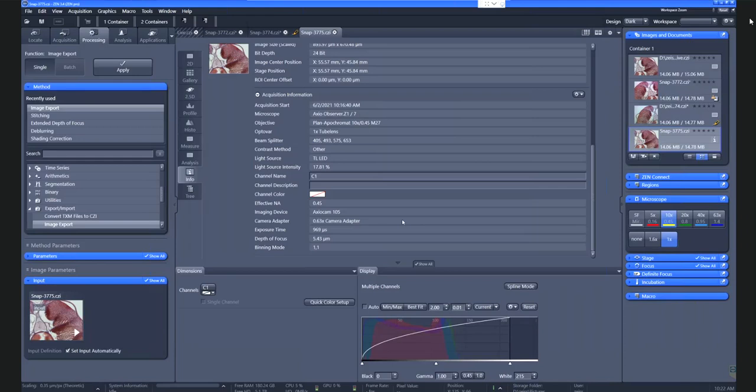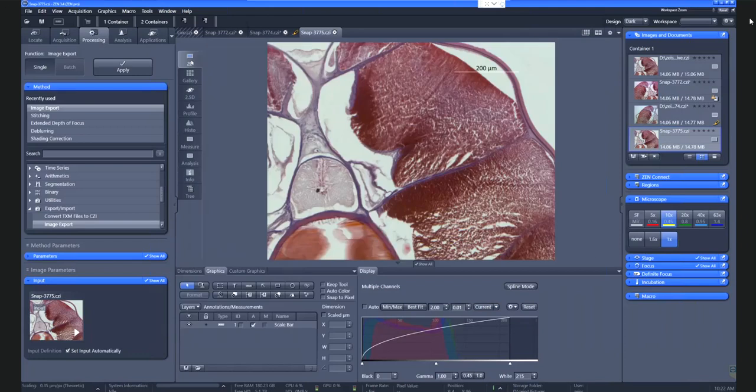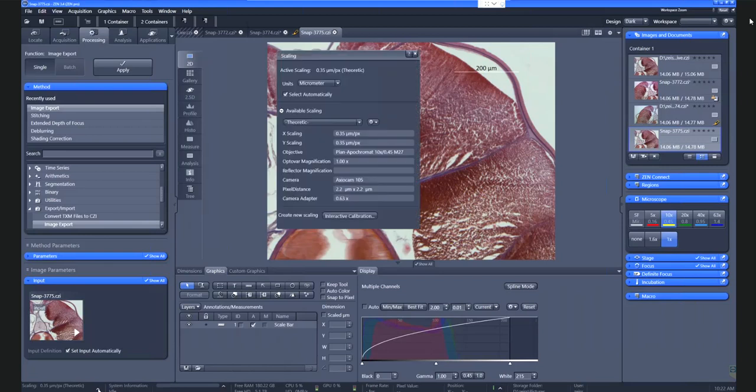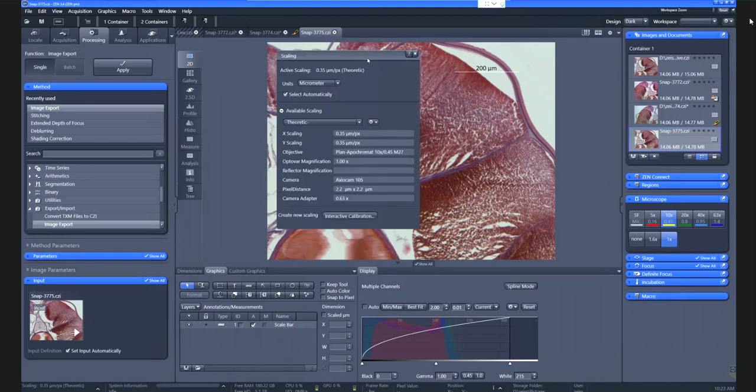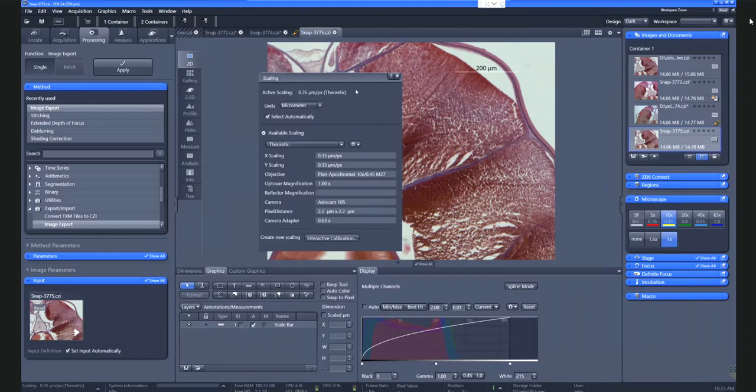Sorry to interrupt you. This is Ruth. I just saw there was a question. Maybe it would be good just to answer right away. One of our participants missed how you selected the scaling window. Okay. So lower left, very low at the left, I have access to the scaling. You see? Okay. Thank you very much. Welcome.